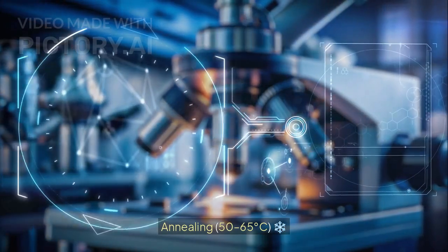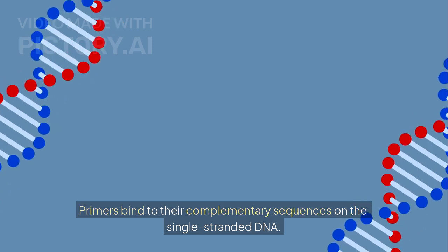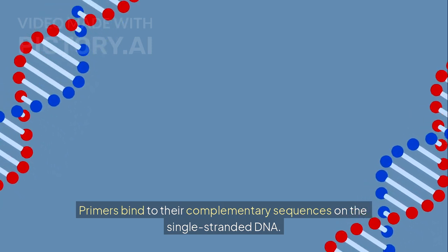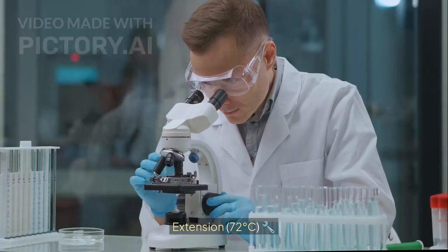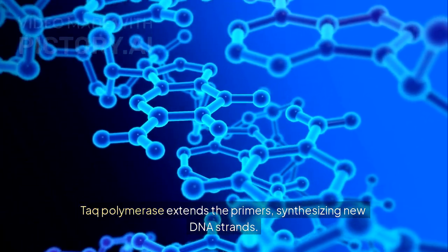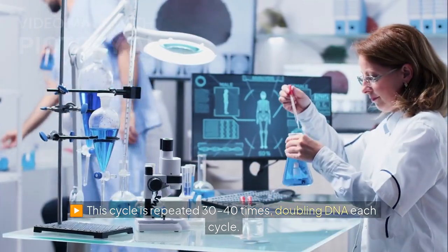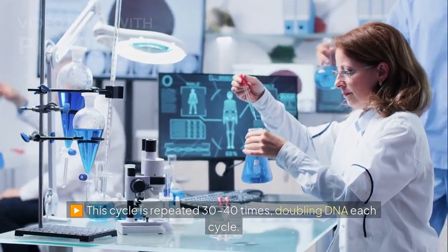Annealing, 50 to 65 degrees Celsius: primers bind to their complementary sequences on the single-stranded DNA. Extension, 72 degrees Celsius: Taq polymerase extends the primers, synthesizing new DNA strands. This cycle is repeated 30 to 40 times, doubling the DNA each cycle.